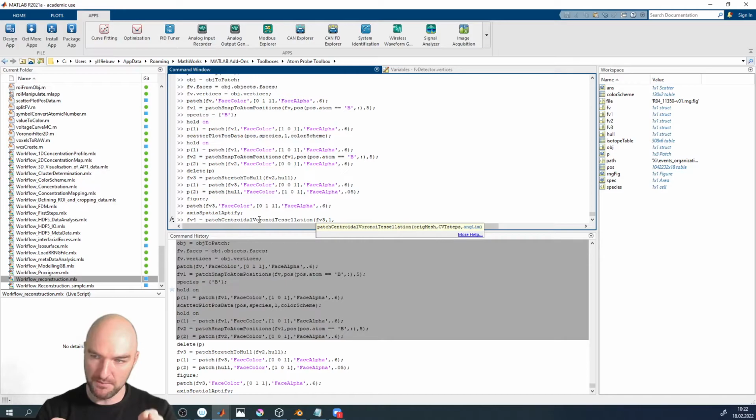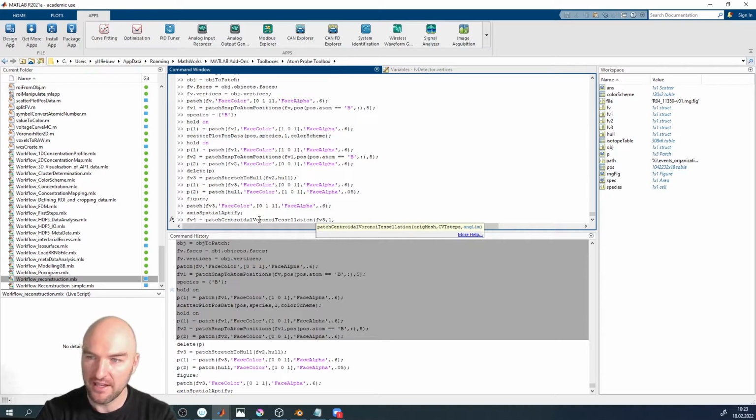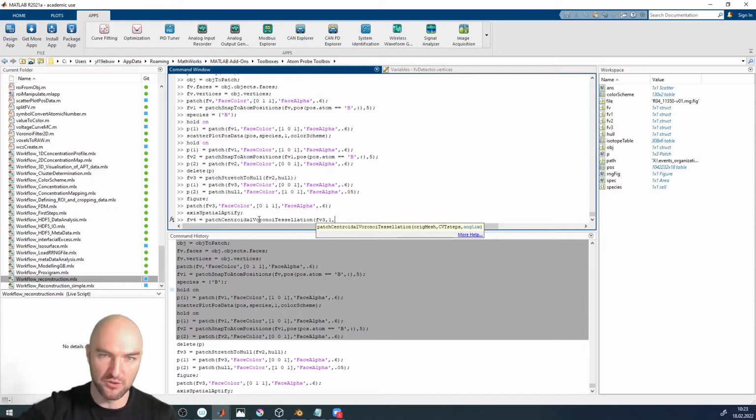But just imagine you had a rectangular region of interest that you're working on, and your interface that you've created goes all the way to the boundary of the rectangular interface. What the algorithm would like to do is round out that rectangular interface, to make everything round. That's why I've put in an angle limit: if two vertices have an angle between them that is smaller than that angle limit, these vertices are going to be pinned. We're not going to move those vertices. So if you have any corners, they're going to be preserved.